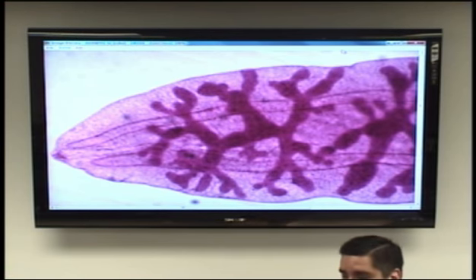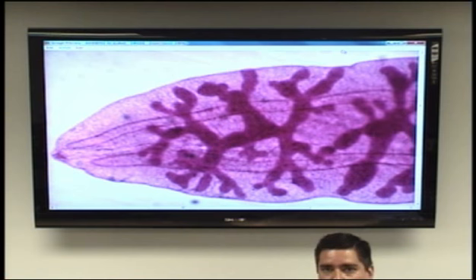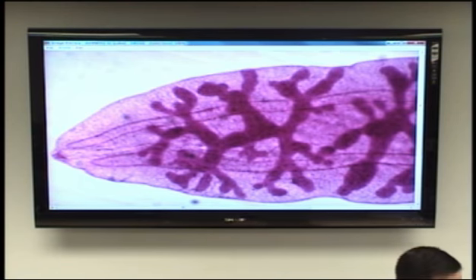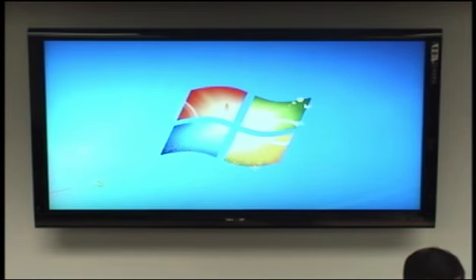He or she could put the image up on the screen and it would give the students an idea of what they were looking for, so that it would aid in their search. There are just a number of uses for this sort of application. So very useful for the student as well as the TA.